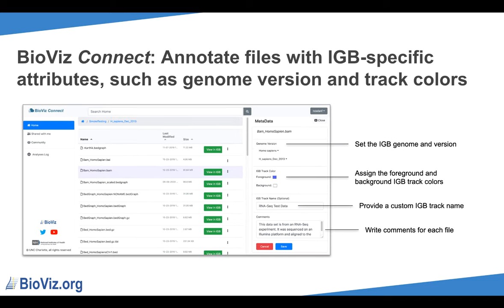To make the experience of viewing files in IGB even easier, files can have IGB-specific metadata added to them. This metadata is then used when viewing the file in IGB to load the correct genome version, set the track color for the file, and to customize the track name. Open the metadata panel by right-clicking on a file and selecting Metadata. Use the drop-down menus to select Genome and Version. Note that these are the default genomes and versions available in IGB. Once you have finished making all of your changes, make sure to click Save.